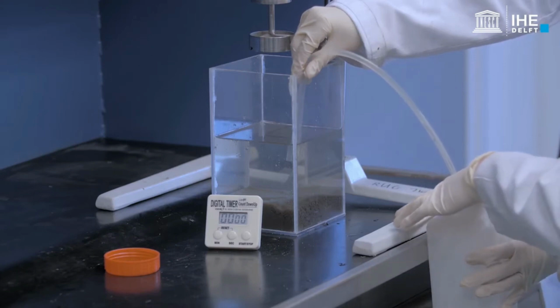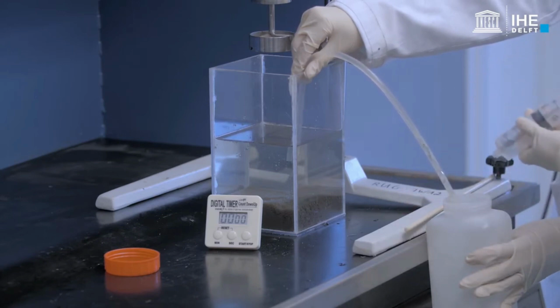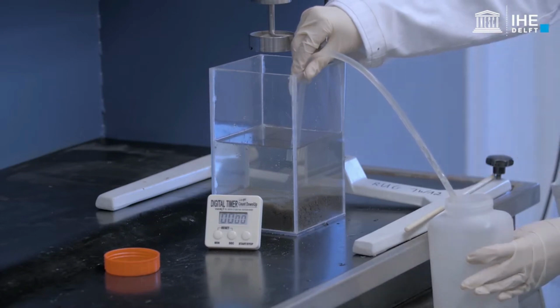When supernatant starts to flow through the tube, remove the syringe and sample 500 millilitres of the supernatant into a recipient. Analyse the sampled supernatant for suspended solids concentration in the lab.